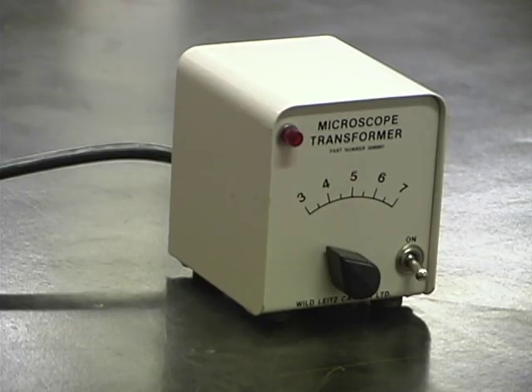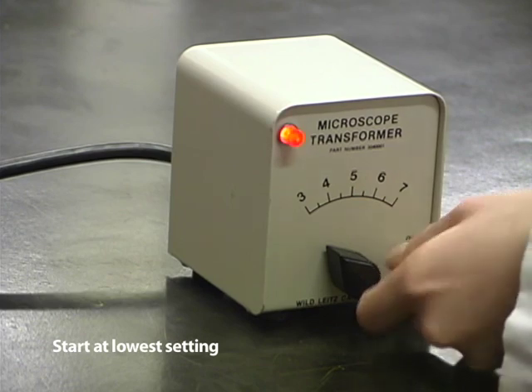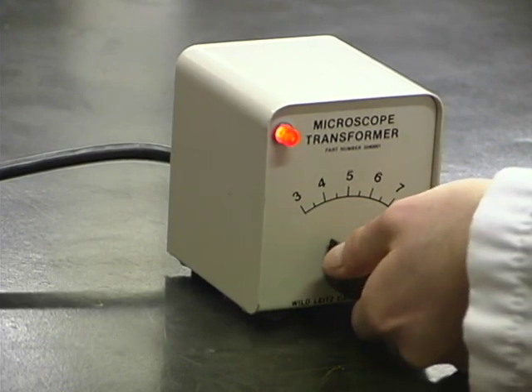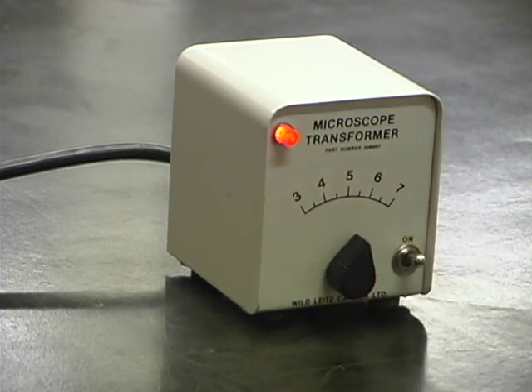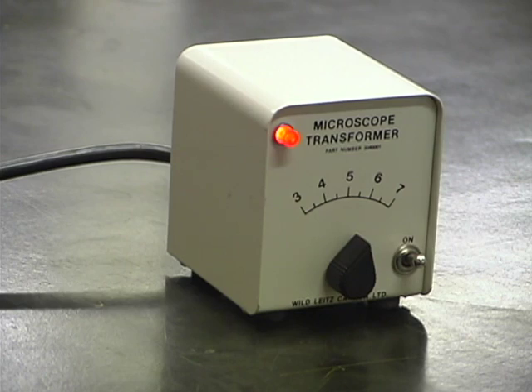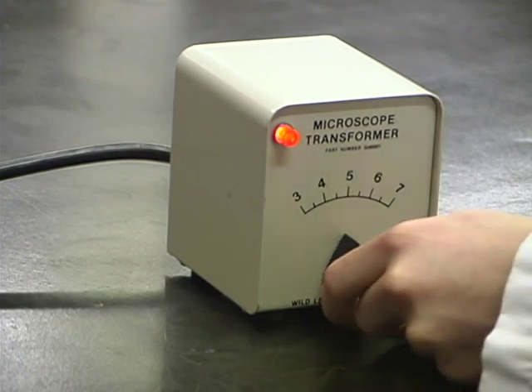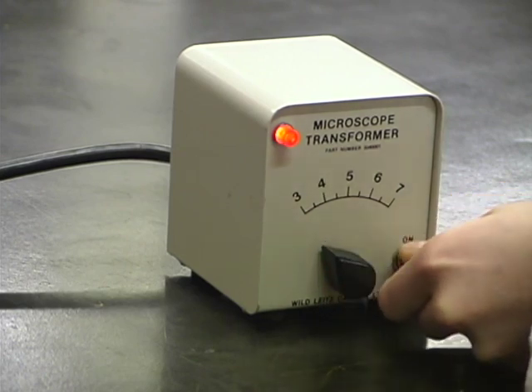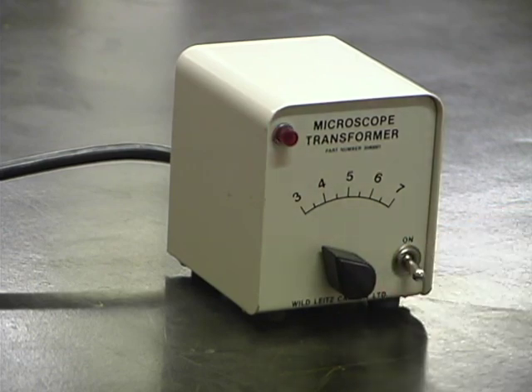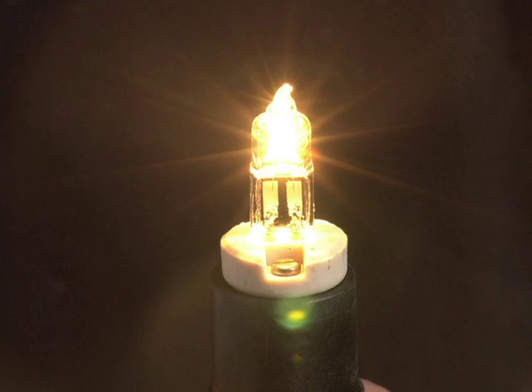You should always start off with the lowest setting and gradually increase it to the point that the object is clearly illuminated and is still comfortable to your eyes. When you are finished using such a microscope lamp, you should turn the transformer to its lowest setting before it is turned off so that the next time it is used, it cannot accidentally be put into a high setting and burn out the light bulb. Microscope light bulbs are expensive.